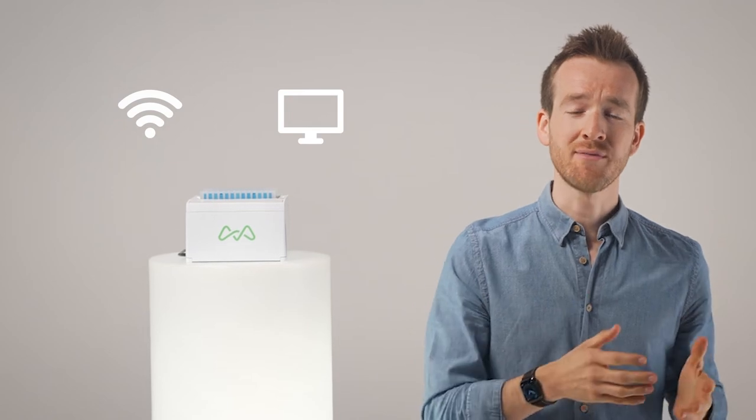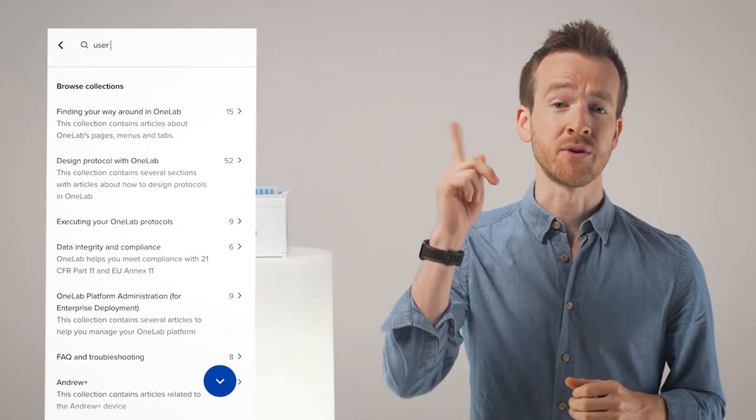But first things first, let's get connected by pairing Heater Shaker Plus to your workspace. The device pairing process can be done either through Wi-Fi or directly via LAN in a few quick steps. Just follow the software prompts and our quick start guides in the user manuals that you can find right here.